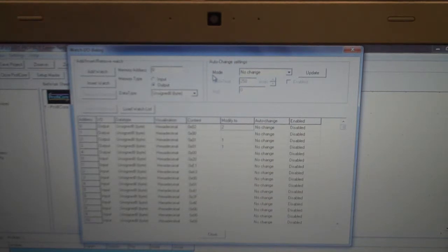So the 2000, like the GC instruments, like the 4060 and the GC Pro, you can do that. So the 2000 is adopting the same scheme, the same feature, so the same commands will work.